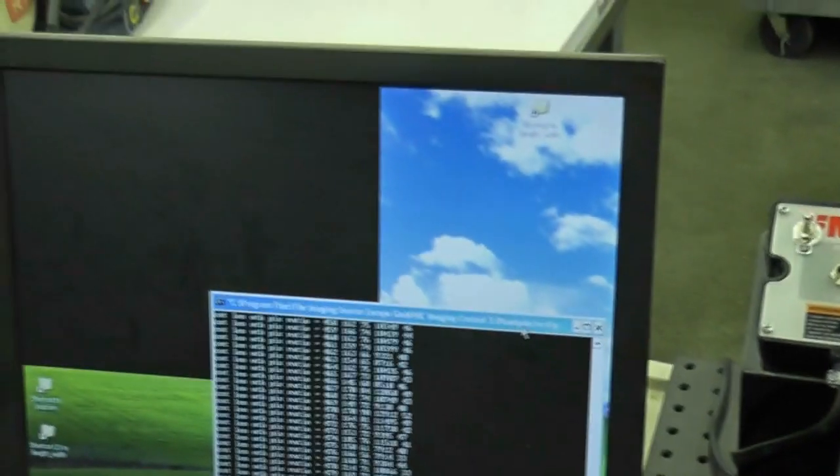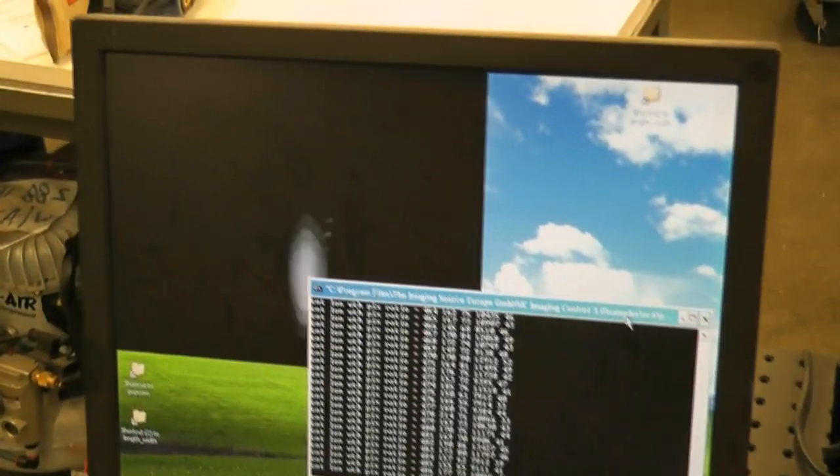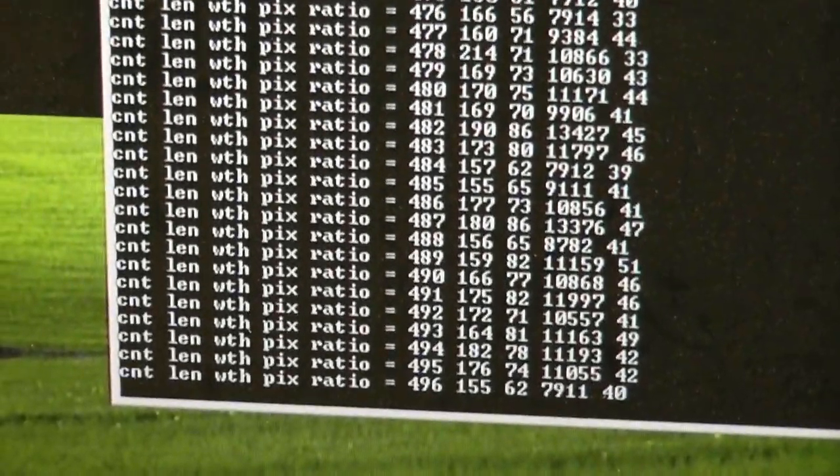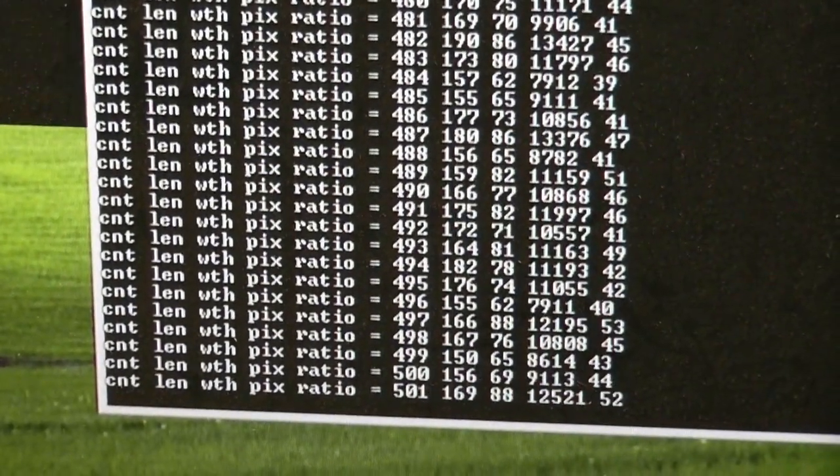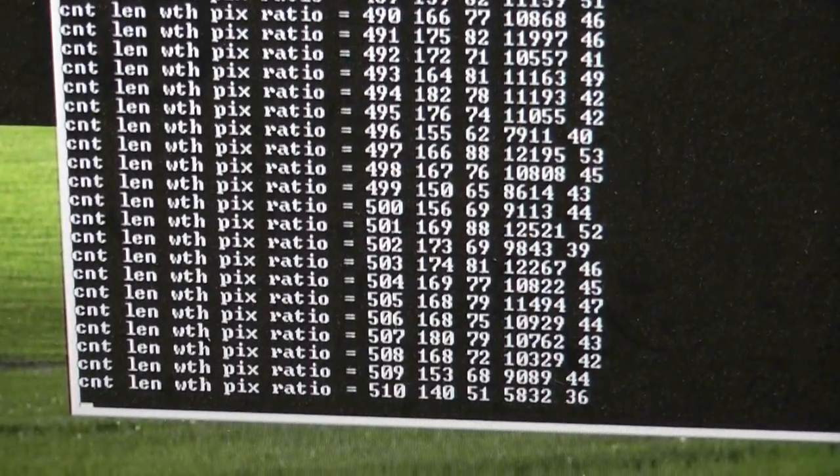You can see here, I'm getting images and data of the kernels. So that's length and width in the area of the kernel and the width or length ratio there on the far right.